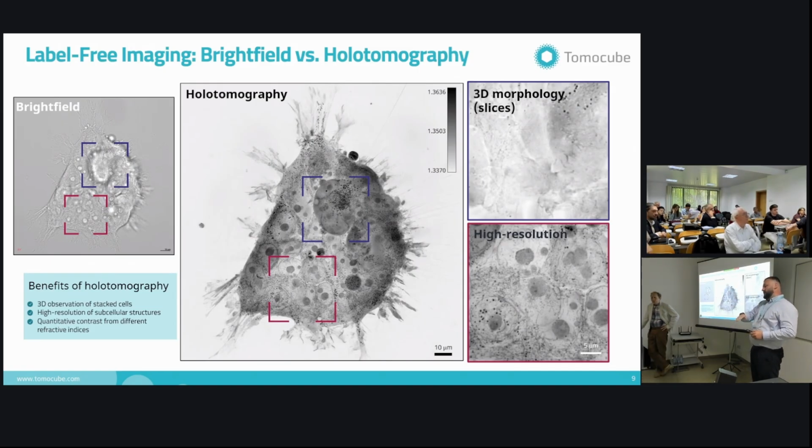The thicker the tissue is, the more scattering you're going to have. So by clearing, you do that. In our case, that's why I say 100, 150 microns. That should be ideal, even for organoids. So the example that I showed you, the organoids, they were like 100 microns.